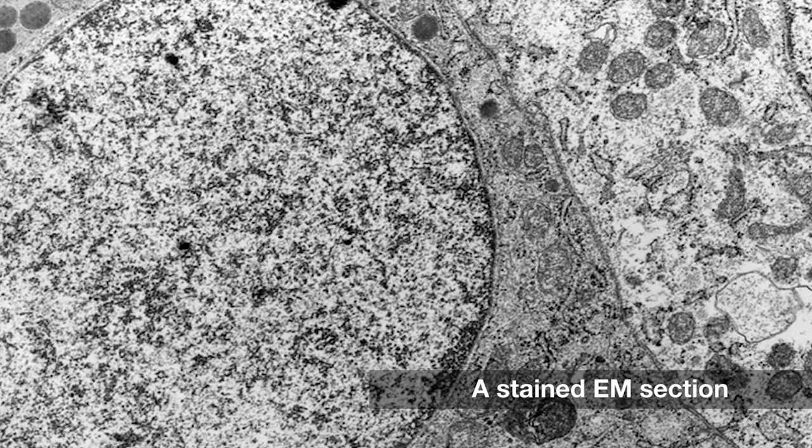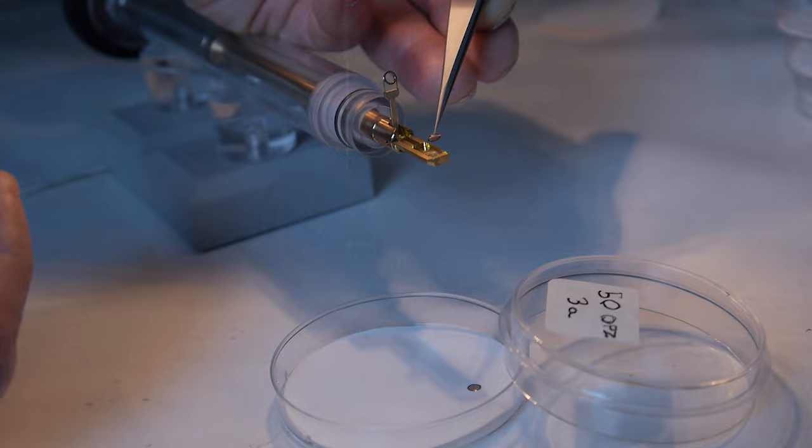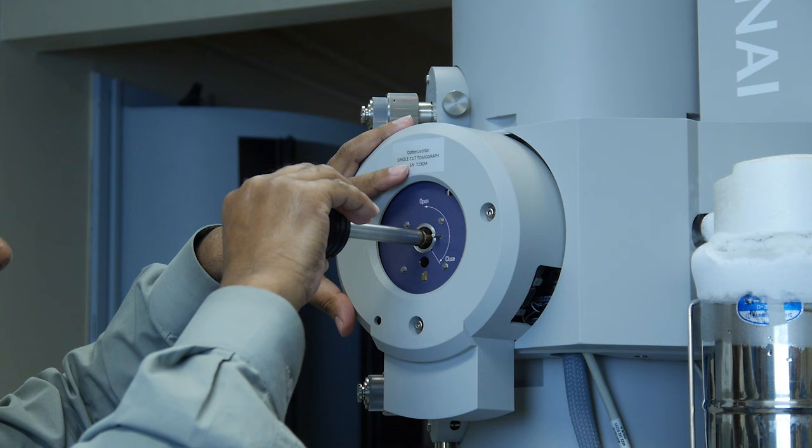This is one of several transmission electron microscopes at Adelaide Microscopy, University of Adelaide. The grid is first placed into the specimen holder and then inserted into the electron microscope.